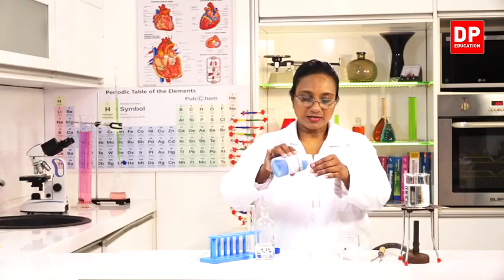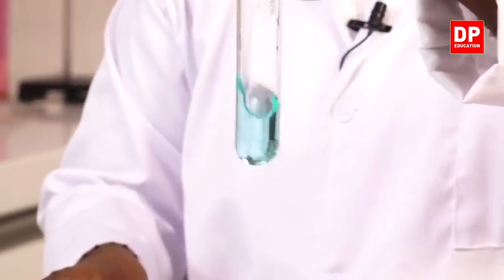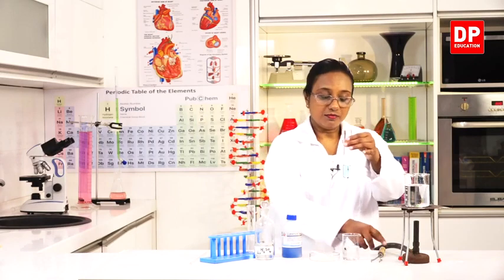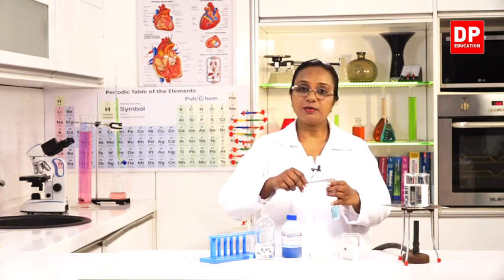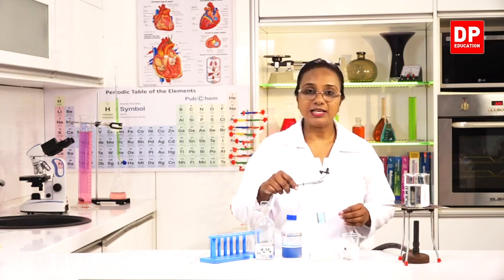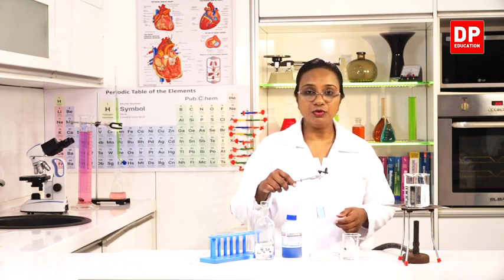So I add a small amount of Benedict solution. When it is mixed, you can see it gives a nice blue color. Now I used a boiling tube to make the sucrose solution because we have to heat it. For heating, we use a water bath. As you know already, a water bath is needed because we need to observe the color change slowly and clearly. If we heat it directly, then the color change will be too fast.